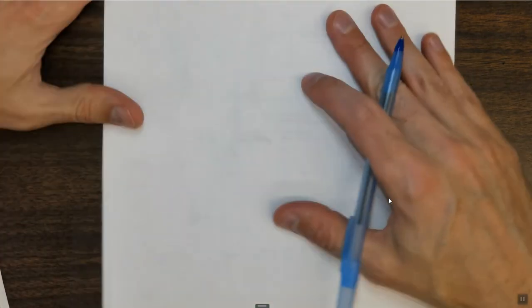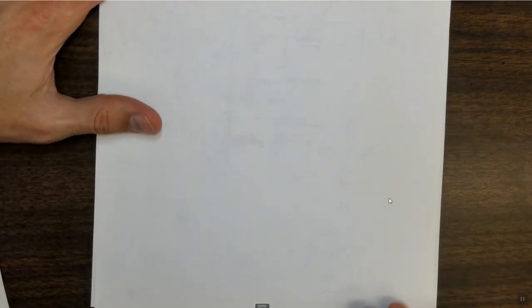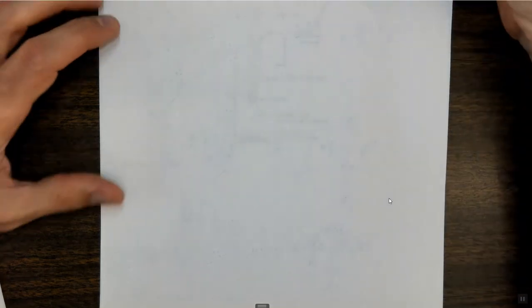And to me, one of the best ways to talk about an extraction is in terms of the separation scheme. Now, this is the last separation scheme that I am going to do completely for you on paper. I will talk about them in future videos, but I'm not going to show the exact separation scheme anymore. What I strongly recommend you do is think about where we're starting from in the separation scheme, which we'll talk about in just a second. And after we've talked about what we're starting with, think about how you're separating these things. One good thing to do is to look at the experimental procedure as you're getting started. As you do this more and more, you're not even going to need the experimental procedure in order to do this.